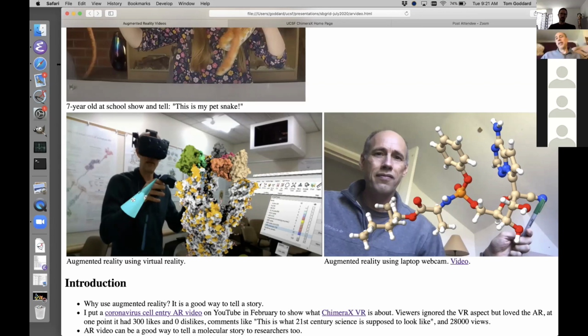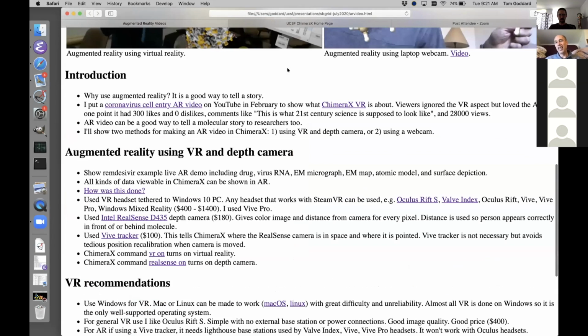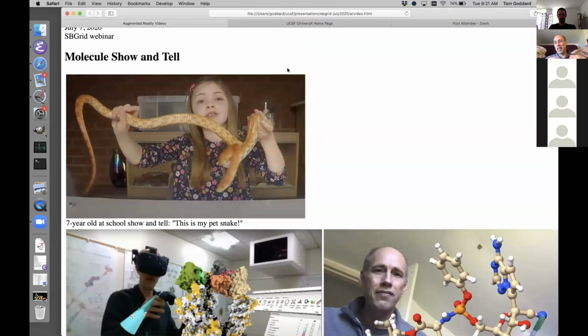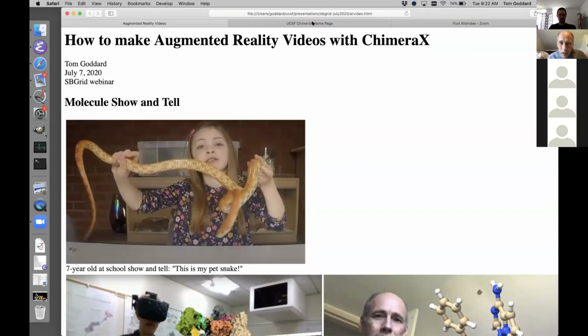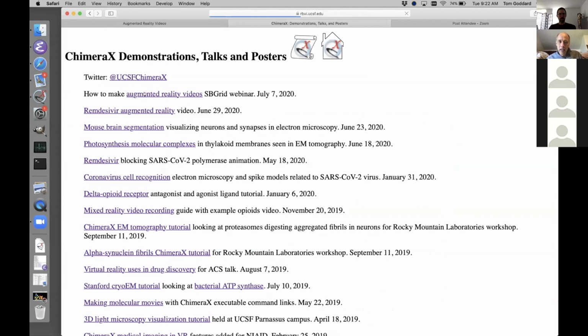By the way, I'm not going to tell you enough details that even if you had all this equipment, you could do it. I just want to give you the idea, but I have a web page online on the ChimeraX website. There's a link on the ChimeraX website to presentations. That's what I'm showing here, this web page. It has a bunch of links to the really nitty-gritty details of how I calibrated this depth sensing camera, and lots of other information. So on the ChimeraX website under presentations, actually here, I'll go there quickly. Here's the ChimeraX website. This presentations link on the left, and at the very top, because I just added it yesterday, how to make augmented reality videos.